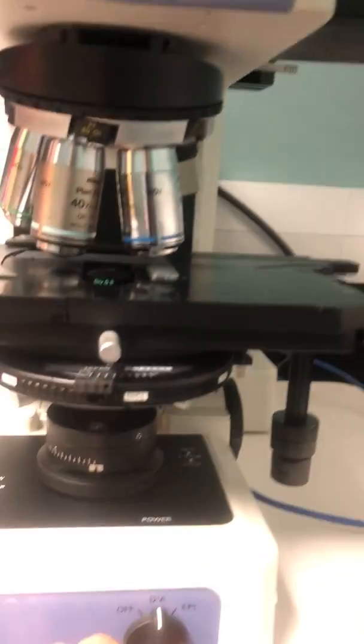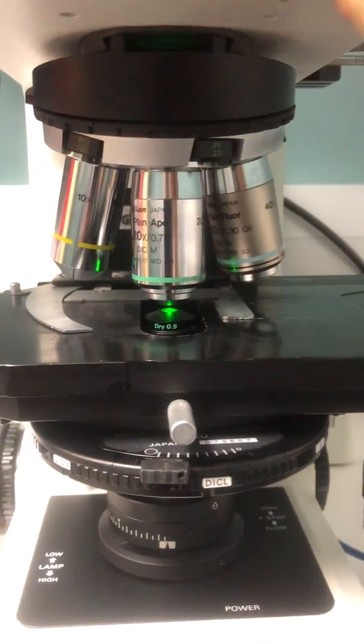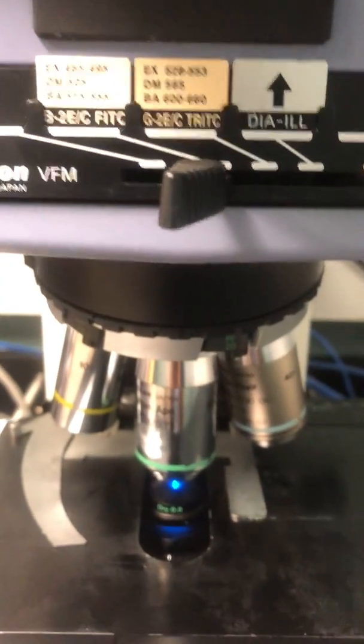And for the green fluorescence, all you're going to do is you're going to take off this slide. You're going to make sure the bright light is off, and then with your slide ready, you can just set it to the right setting. Make sure this is pushed back in so you can see, and then you're going to find your cells on the green. And the great thing about this program is whatever you see here is what is going to show up on the camera.